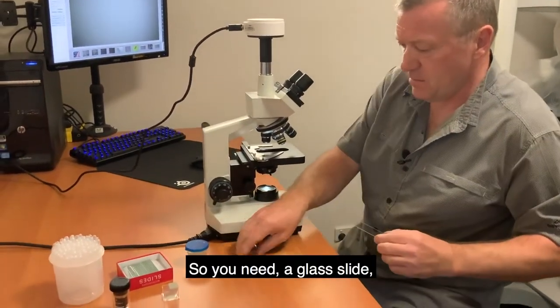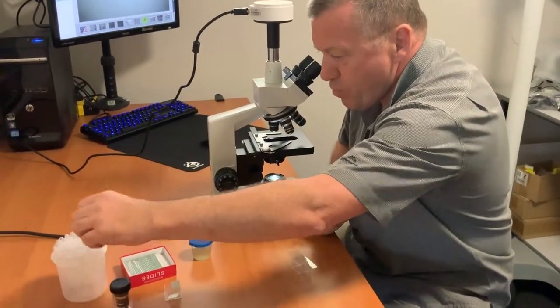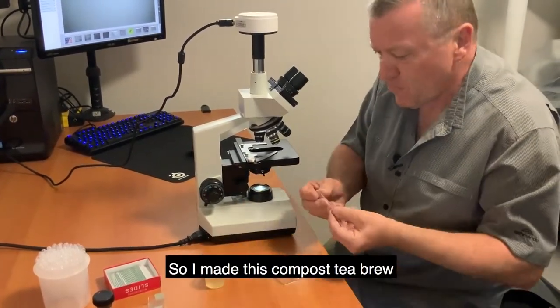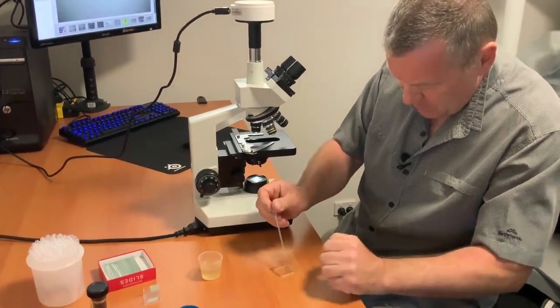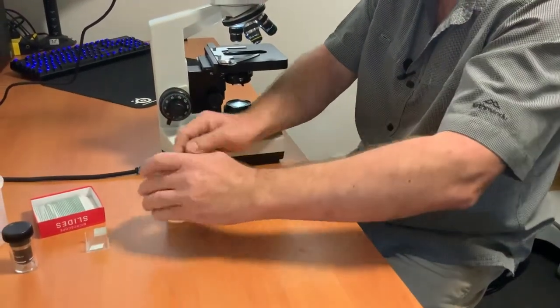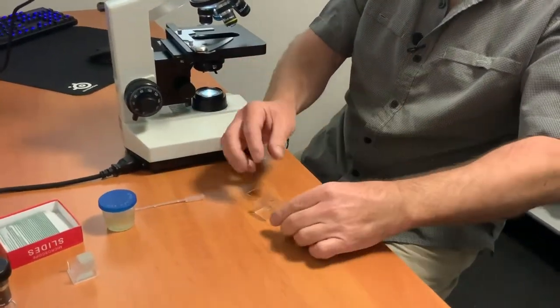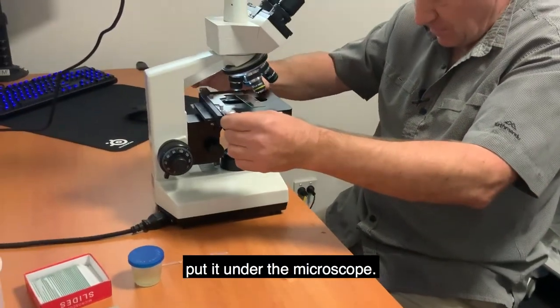To prepare a slide you need a glass slide and a dropper bottle. I made this compost tea brew less than 24 hours ago. You put one drop onto the center of the slide, then place a cover slip on top, and put the slide under the microscope.